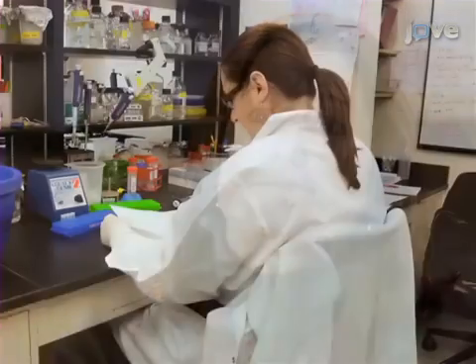The main advantages of this foodborne model are that it is not physically invasive or traumatic for the mice, and there's a reproducible delay of 36 to 48 hours before the bacteria disseminate from the intestines to the peripheral tissues.